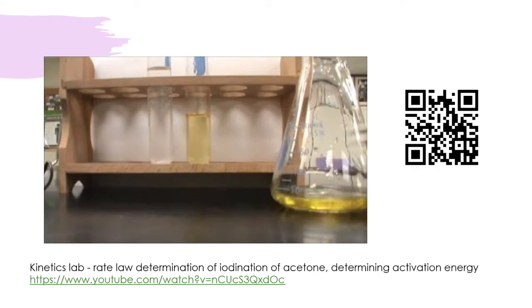Okay, now this is a very good video which I really want you to watch. Now it's not cyclohexanone, but it's a ketone as well. So this is a rate law determination of iodination of acetone. At the same time, there's also an extra part determining the activation energy via changing the temperature.